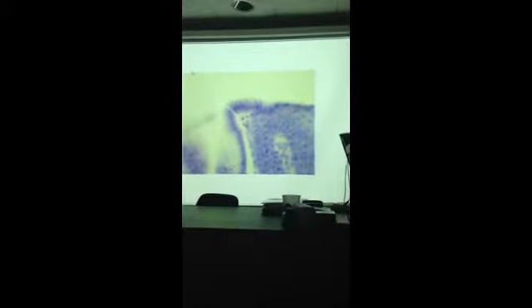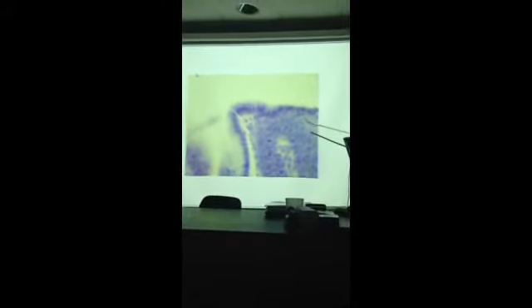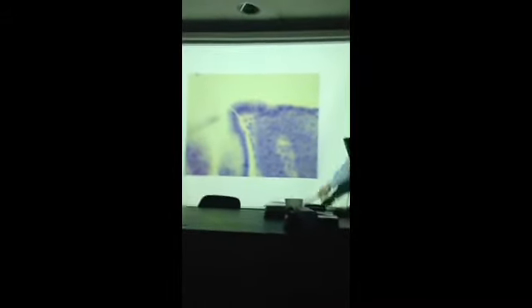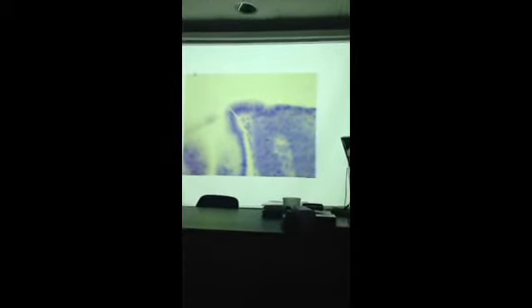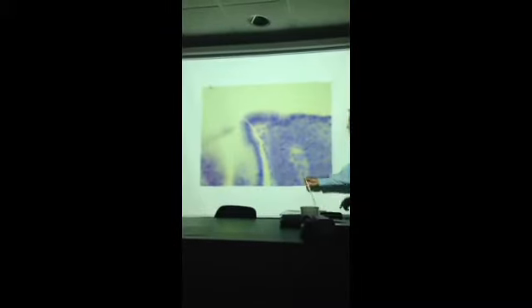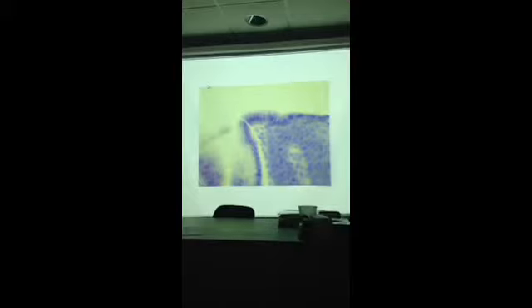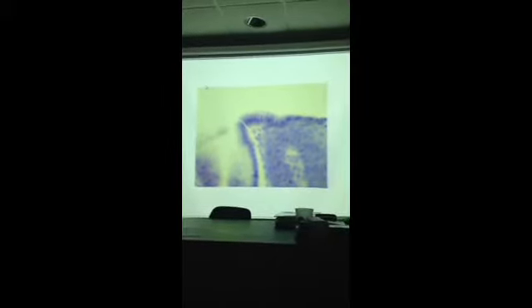Keep it in focus. Look at the cells here. Look at the nuclei on the left there. Long, thin nuclei. And they contain long, thin cells. Columnar. Only one layer, so it's simple columnar epithelium. So stomach, esophagus. That's the junction. That's where the epithelium changes. Okay? Any questions?